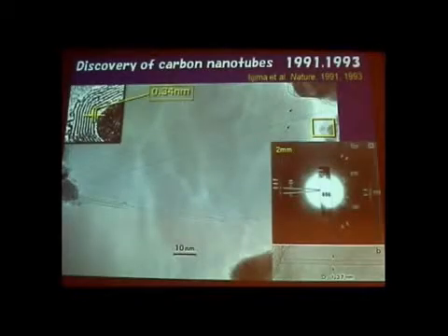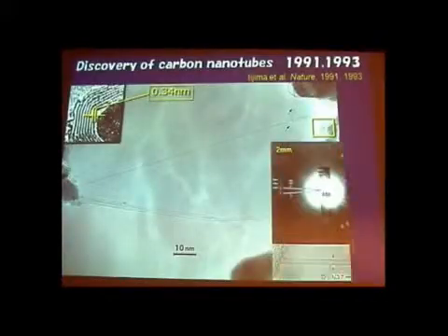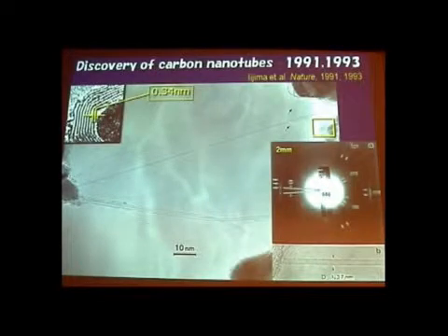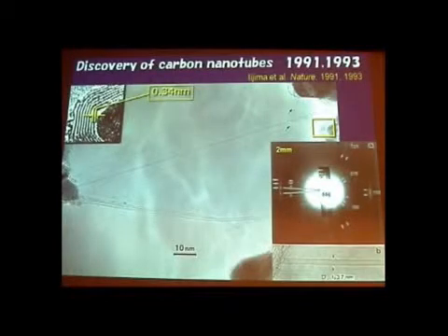If you look at only these pictures, micrographs, I can say the diameter is something like 1 or 2 nanometers. But we cannot tell anything about the atomic structure inside. To say this, you need an electron diffraction pattern or X-ray diffraction pattern. If you analyze this diffraction pattern, then you can say this structure consists of the graphitic structure, carbon hexagons, and the diameters. Without this, maybe this is a carbon nanotube, but there is no direct evidence. So I think this is very, very important, because no one showed this previously.